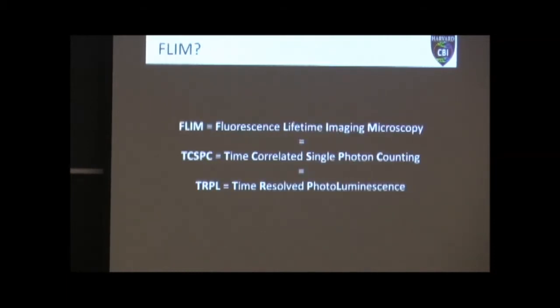So first of all, I'll just point out that FLIM, like everything in microscopy, goes by many names. FLIM stands for fluorescence lifetime imaging microscopy. Sometimes this is also called TCSPC, which is time correlated single photon counting. And in the materials world, this is often referred to as TRPL, time resolved photoluminescence. Essentially, they're all the same thing.